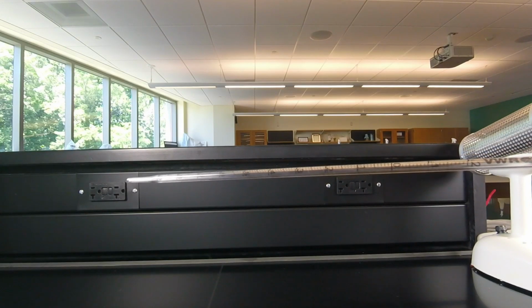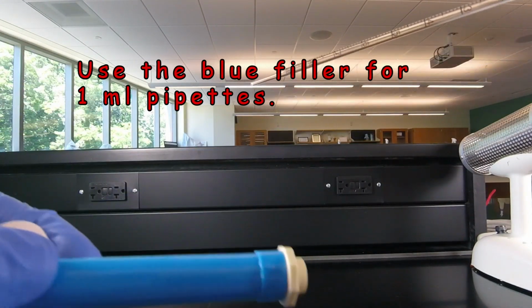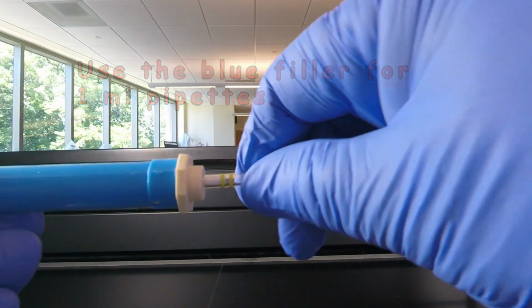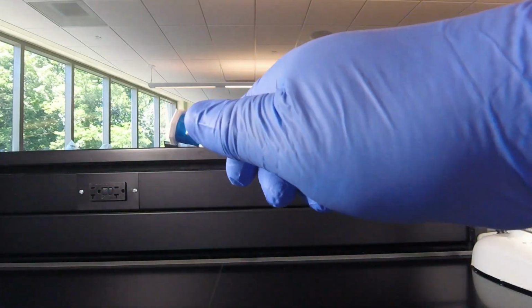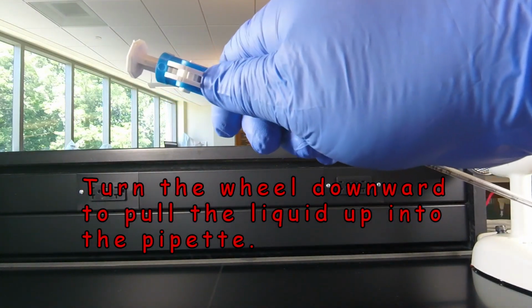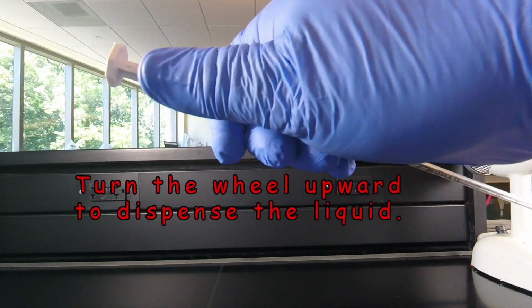Now to begin pipetting, we have to put the pipette into a filler. So for 1 mil pipettes we use a blue filler, and we take the end where the cotton is, we push it firmly into the end of the pipette filler, again not touching the bottom part that's going to go into the tube. And the way this works now is that if we take the knob right here and we start turning it downwards, that's going to suck the liquid up into the pipette and hold it, and when we push it upwards, that's going to dispense the liquid.